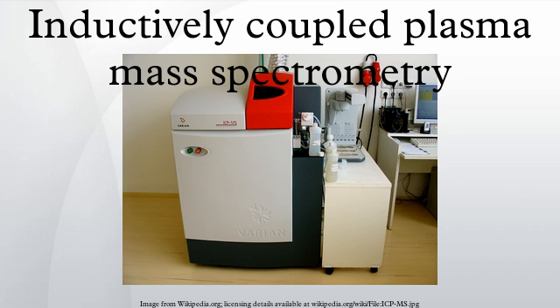Routine maintenance. As with any piece of instrumentation or equipment, there are many aspects of maintenance that need to be encompassed by daily, weekly and annual procedures. The frequency of maintenance is typically determined by the sample volume and cumulative runtime that the instrument is subjected to.